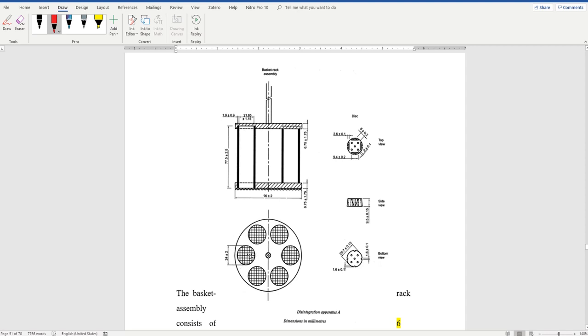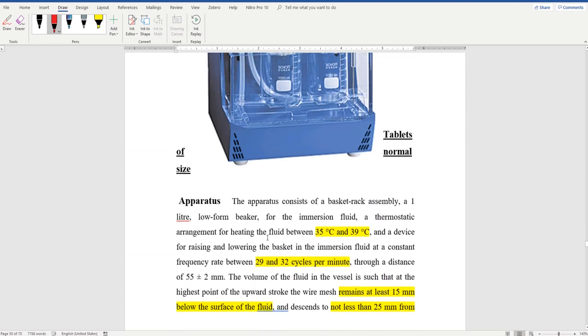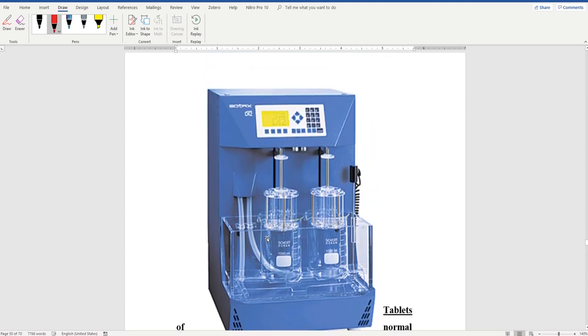We are not concerned with that. Capsule shells are not taken into account when we look at the disintegration of capsules. And it's important that any fragments that remain are soft and wetted. Is it clear?